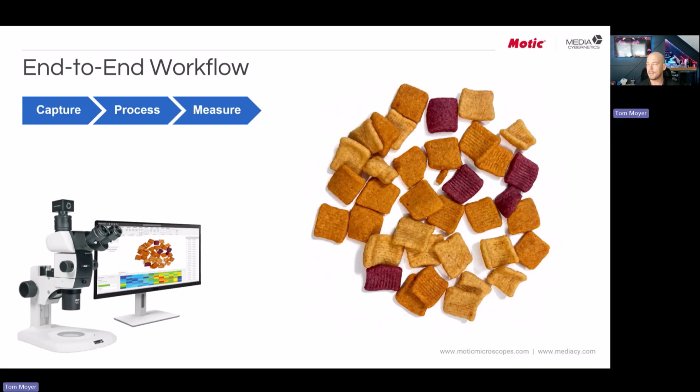Then, of course, the main part of Image Pro is going to be the analysis workflow. So that starts with measurement, and that would be finding objects or areas, patterns within an image, maybe classifying them. And finally, reporting. Our goal is always to set up some sort of workflow where you can click a single button and you can just batch process as many images as you like without having to go through that step-by-step workflow every time you want to perform the analysis.